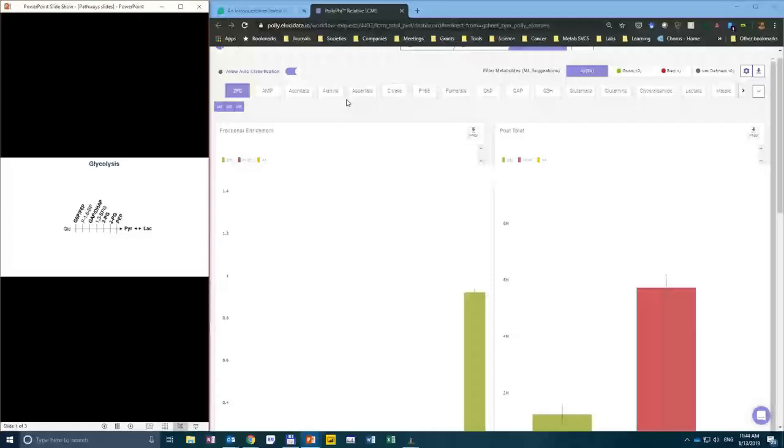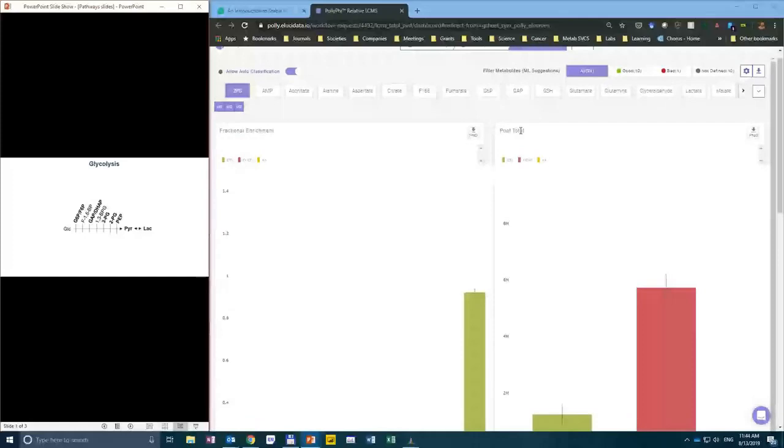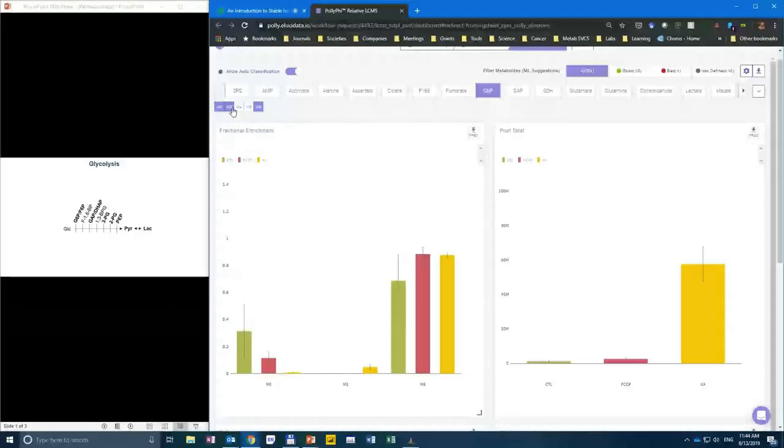But I'm just going to show you specific patterns that we can see that help us really get an idea that the data was actually properly assigned, and that this is aligned with not only analytical expectations, but also with biological expectations. So starting with glycolysis, we start with fully labeled glucose, that's 6 carbons. And if we look at glucose 6-phosphate that is downstream, notice that we have 3 major isotopologs here. We have the M+6 isotopolog, which means that all 6 carbons have been labeled. There's an M+3, and there's M+0.